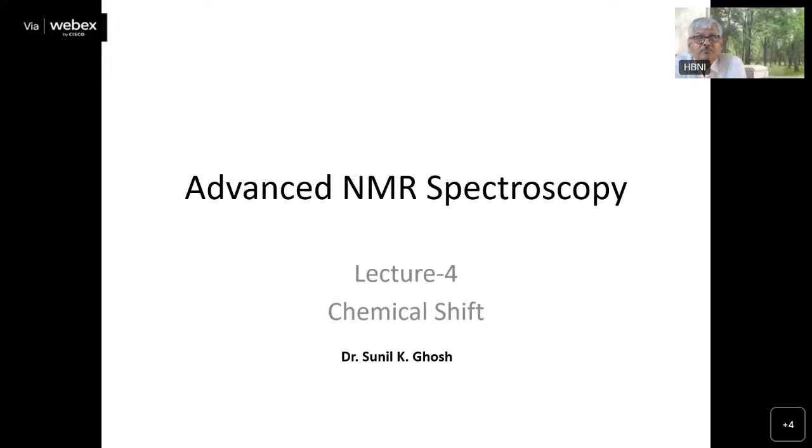Good afternoon and welcome to Advanced NMR Spectroscopy course. Today is lecture 4 and I'll speak today about chemical shift. This is a new topic now.